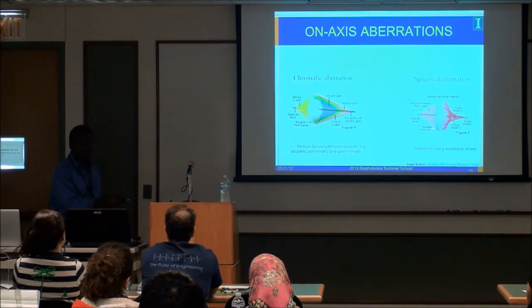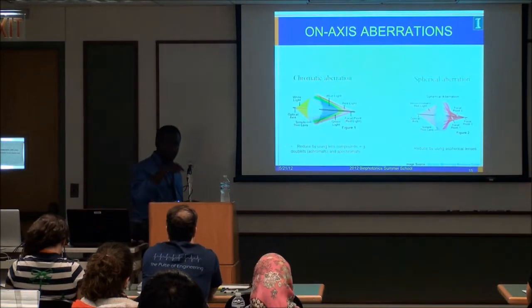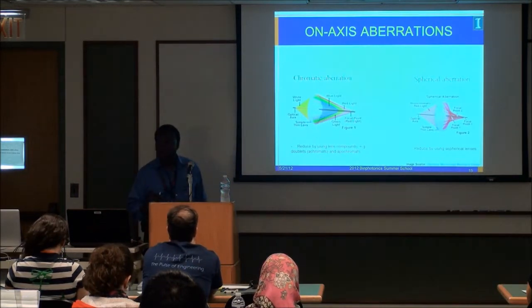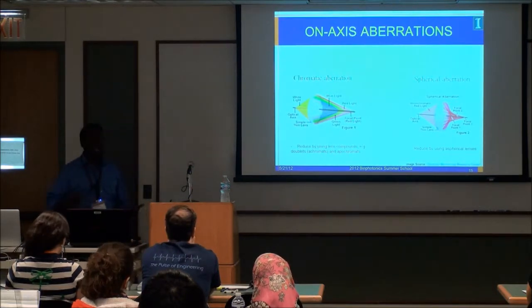The light at the extremities is going to focus to a different spot. So this is actually a very prominent problem, you're going to get distortion in your point. Ideally, what you want is a nice circular symmetric spot that's defined by your diffraction limited optics, as Abby put it. So you can reduce this by using aspherics. So this all comes down to lens design, right?